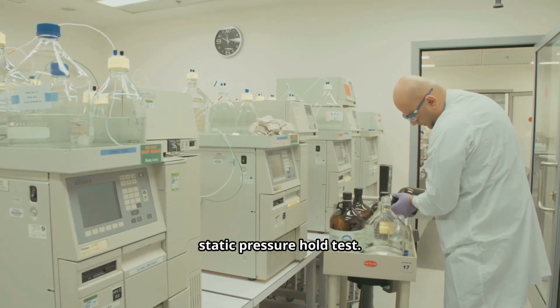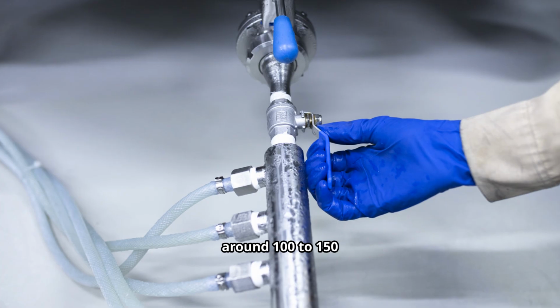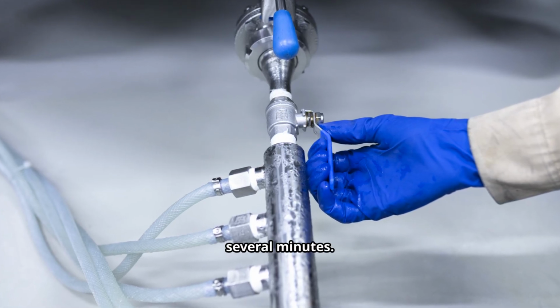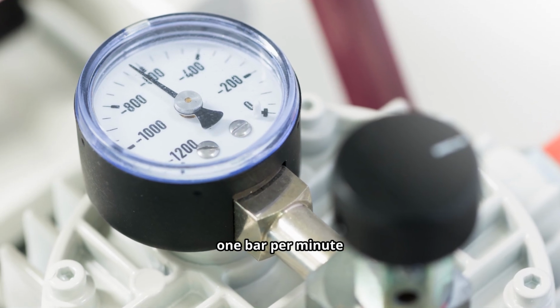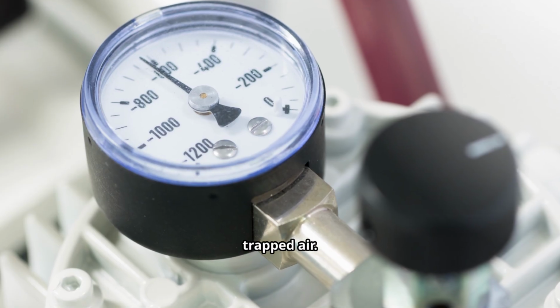Next, you perform a static pressure hold test. The system is pressurized, typically around 100 to 150 bar. Then the flow is stopped, and pressure is monitored for several minutes. As a practical guideline, a decay of about 1 bar per minute or less is generally acceptable. Faster decay suggests a leak or trapped air.